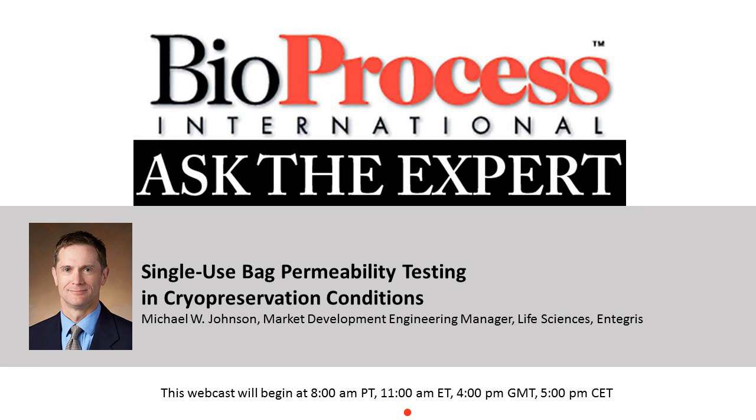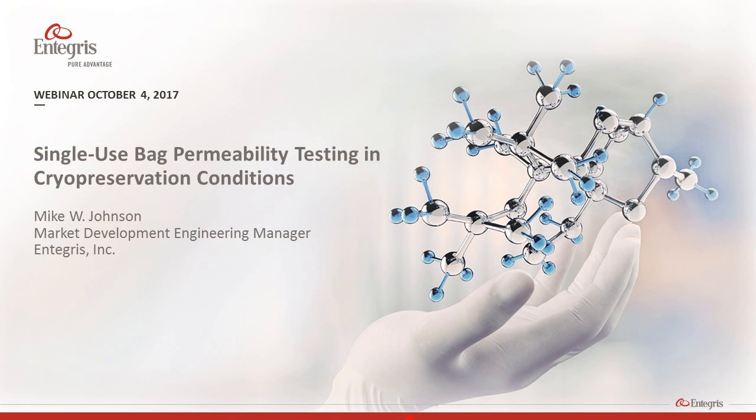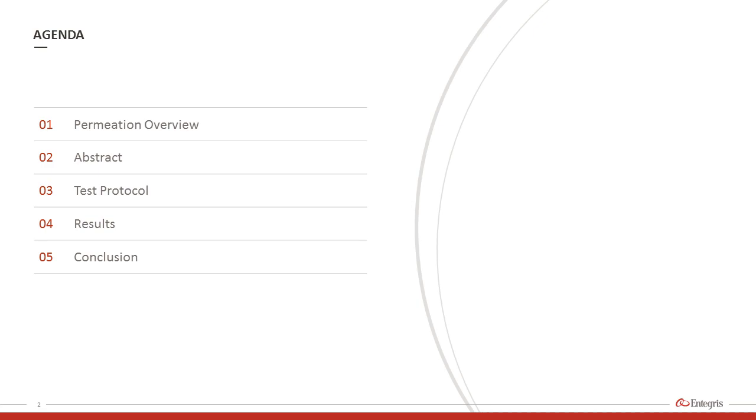Today I'll be discussing single-use bags and gas permeation. So let's get started. The agenda for today's presentation includes a permeation overview, a review of the abstract and test protocol, an assessment of the results, followed by a conclusion summary, and some discussion time.